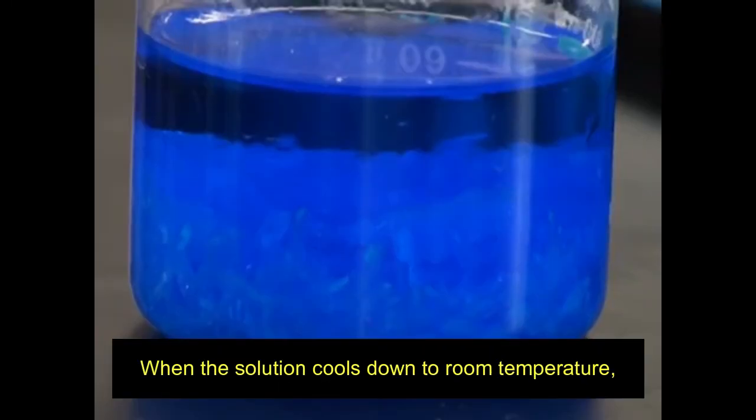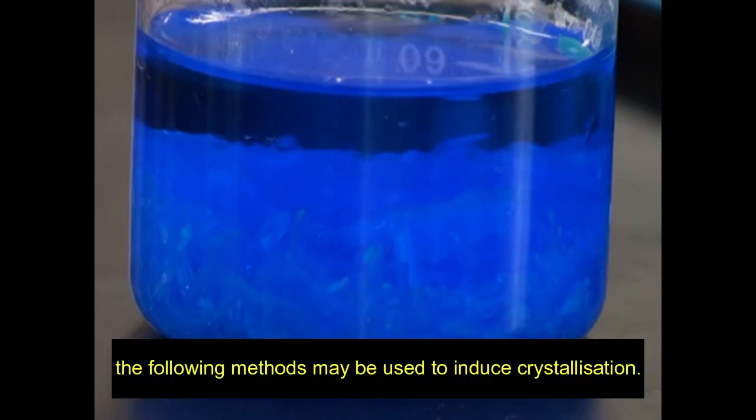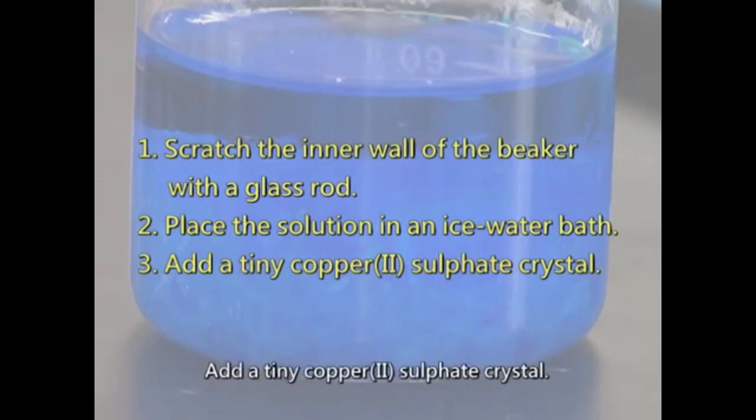When the solution cools down to room temperature, crystallization of copper 2 sulfate is completed. If there is no crystal formed after cooling the solution to room temperature, the following methods may be used to induce crystallization. Scratch the inner wall of the beaker with a glass rod. Place the solution in an ice water bath. Add a tiny copper 2 sulfate crystal.